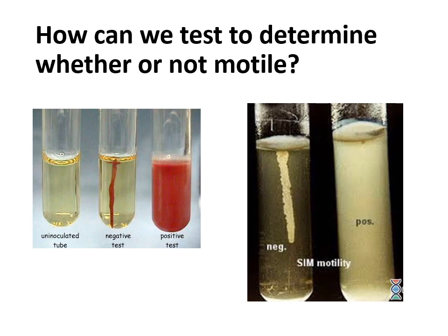Now, if you were thinking of the bacteria itself, when you see something like this, where it turned cloudy, that would be a bacteria where you see flagella on it or axial filaments on it. If you see something that's just round or rod-shaped and has nothing protruding out of it, then odds are it would stay in a straight line, unable to move on its own.